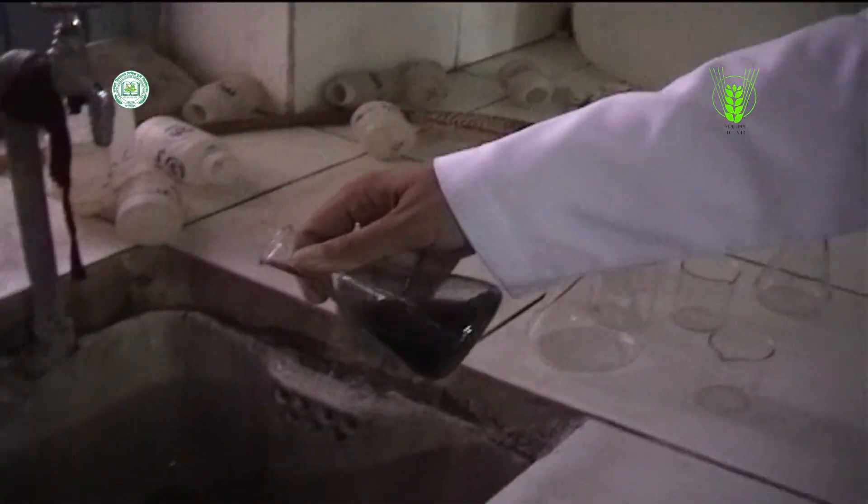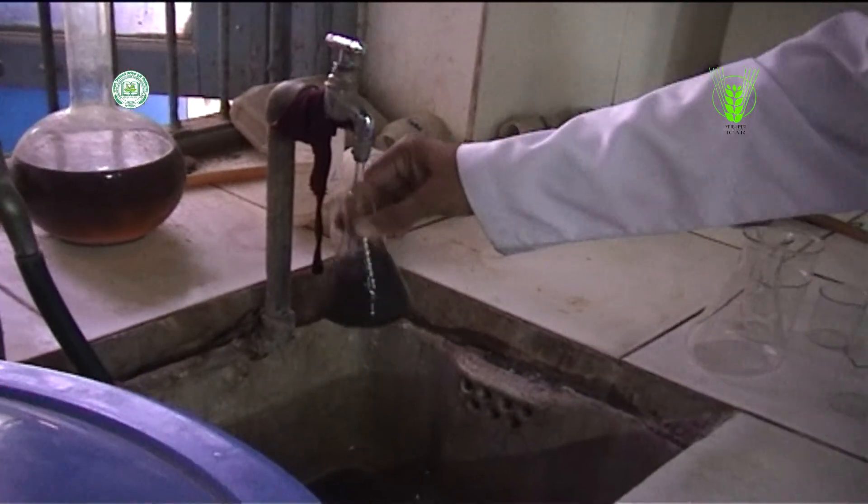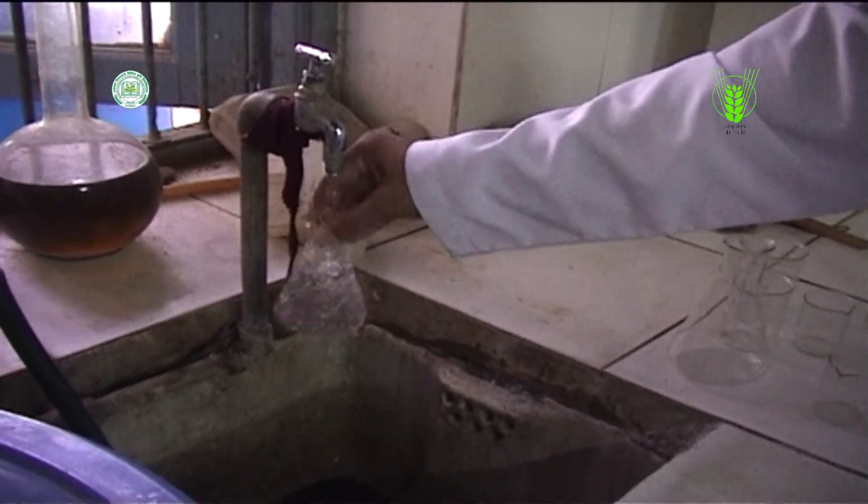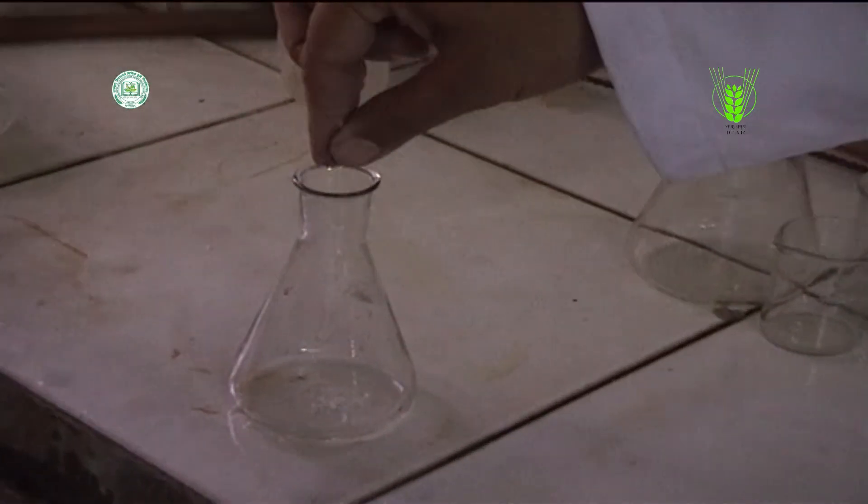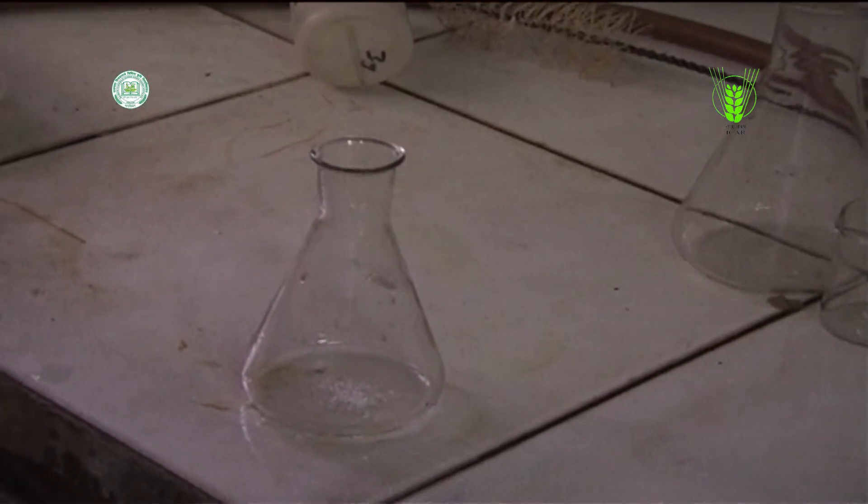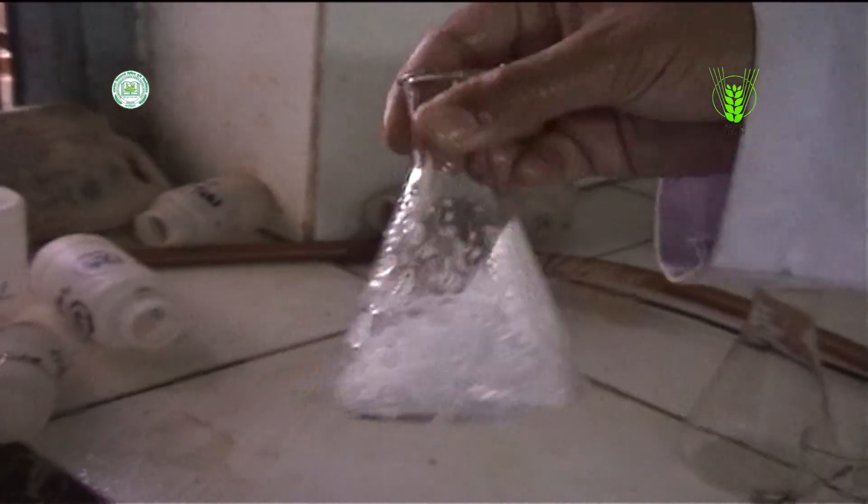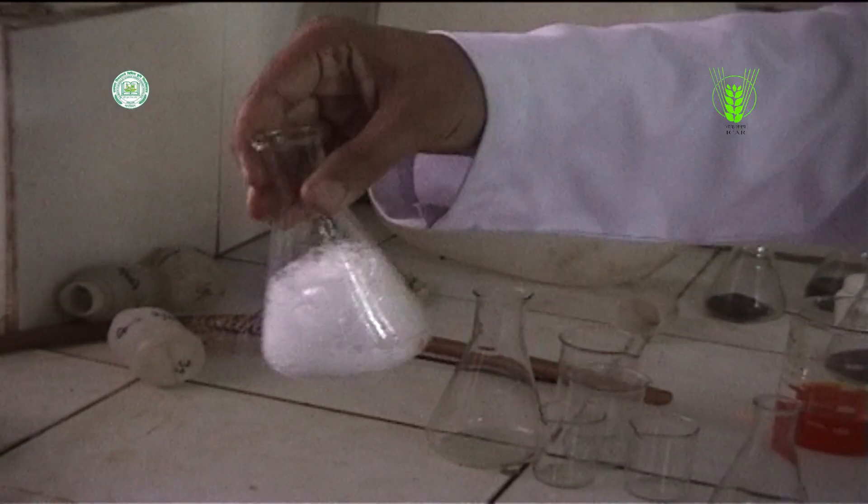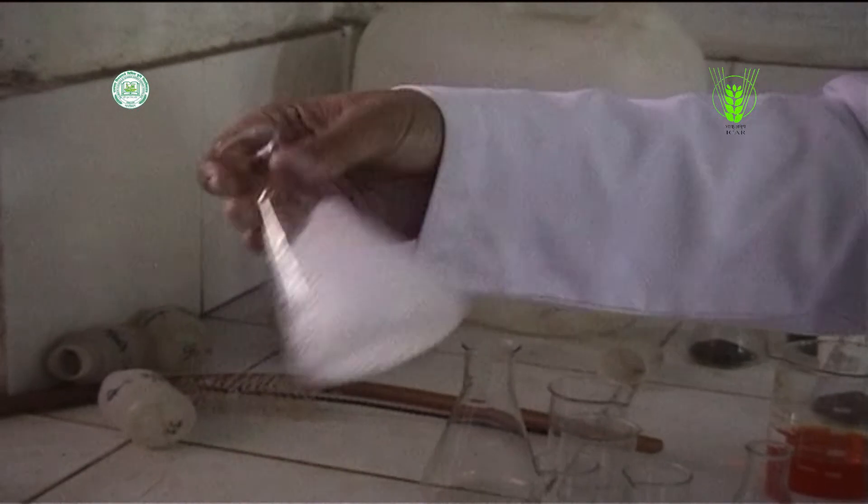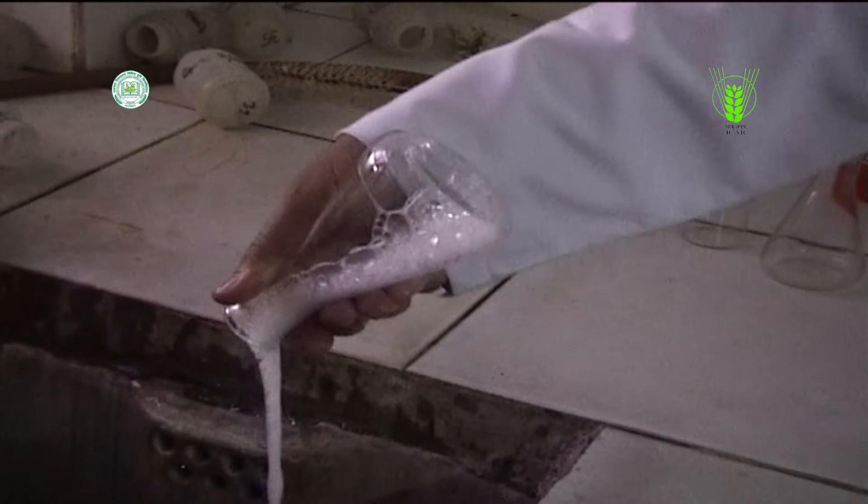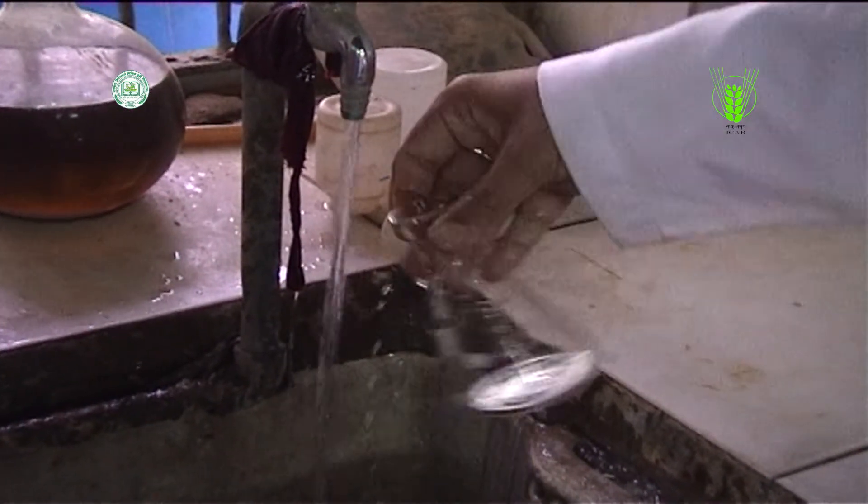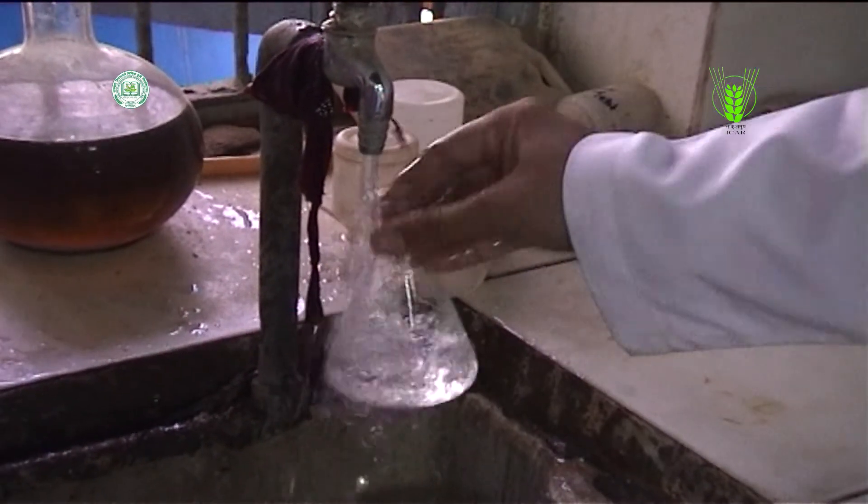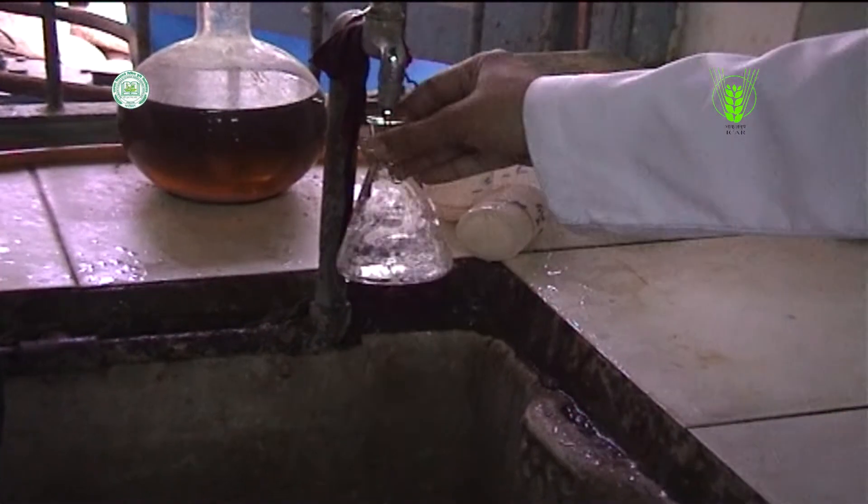Cleaning of glassware before and after analysis work. Glassware should be neat and clean. If there is any dirt then remove the dirt by simple washing or wash with detergent powder. If glassware cannot be cleaned by simple washing or use of detergent powder, we have to use 5% chromic acid solution to wash the glassware.